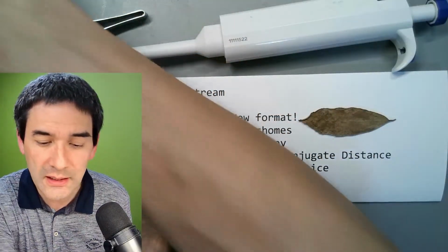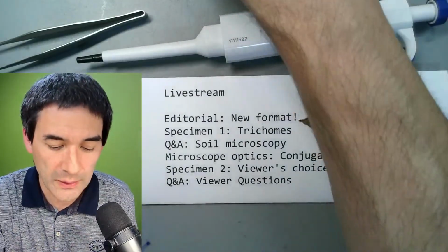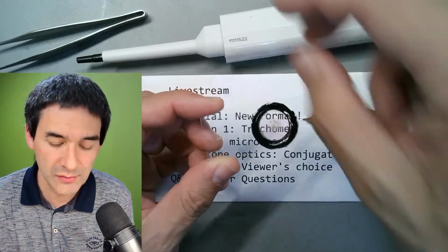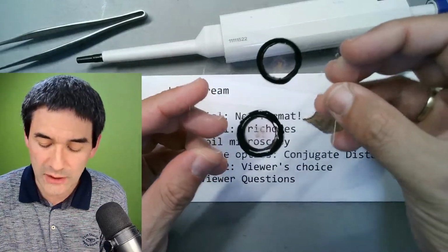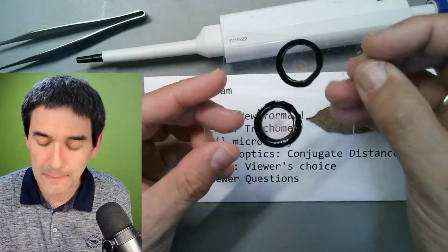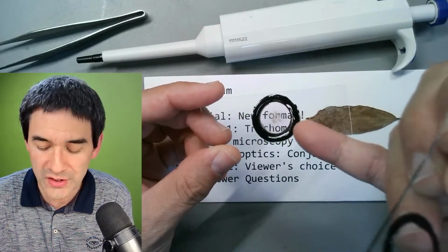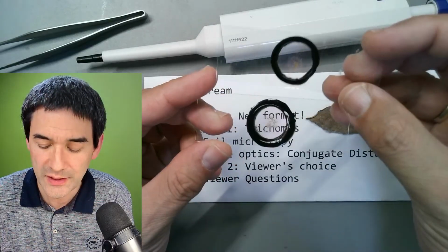So another thing that I want to briefly mention here is a little bit of a recap from last week. You see those slides here, right? Maybe if you remember, I made those ringed slides with glycerin gelatin. Not very nice looking, but I simply wanted to show you that when the nail polish starts to dry, of course, it starts to shrink, and then we can reapply another ring here, right?